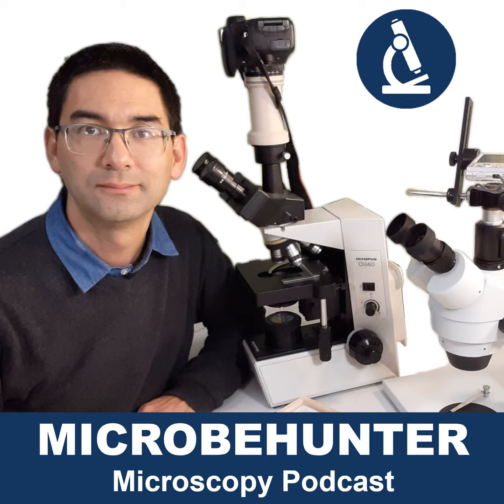A slightly different approach. Some people might already have an existing hobby, like for example stamp collecting or mineral collecting, and if you then have a so-called stereo microscope, this adds another dimension to an already existing hobby, because observing your own stamps or minerals or insects, for that matter, under a stereo microscope is quite interesting.